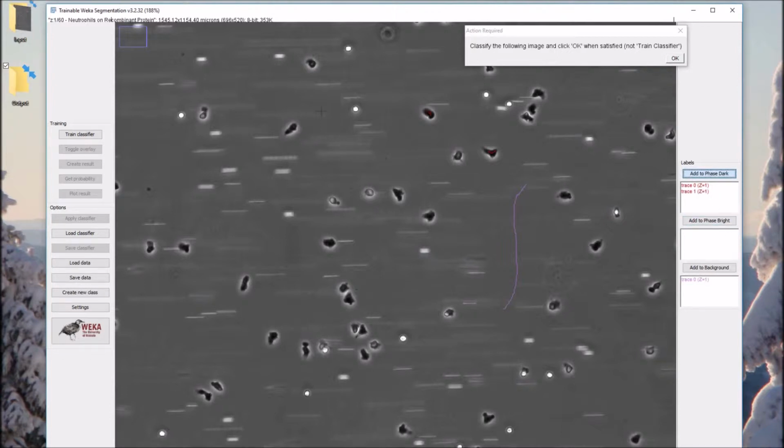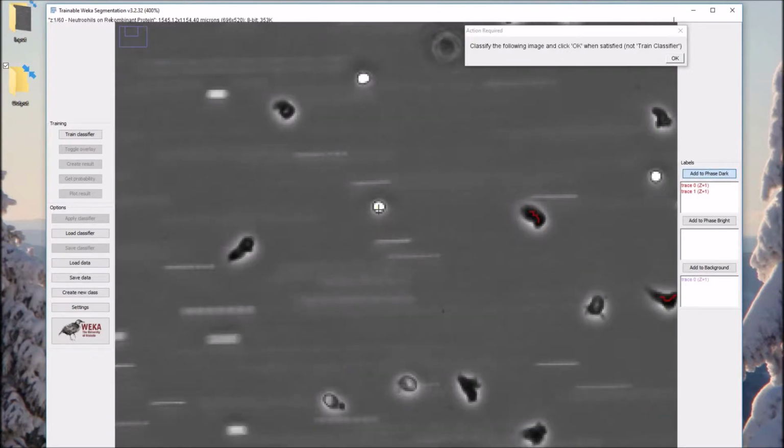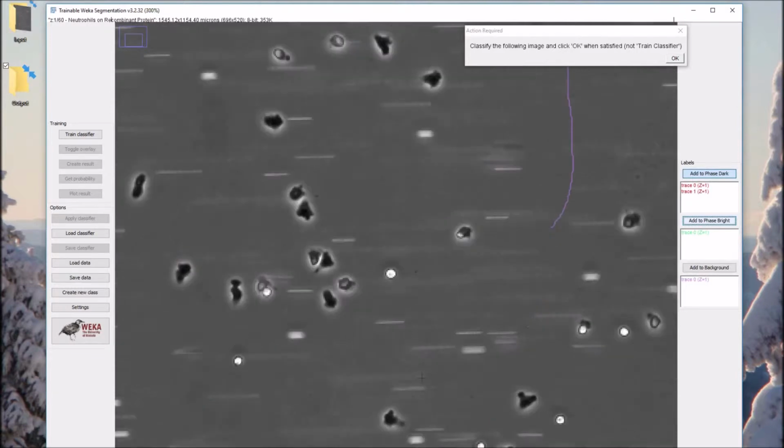To run the process, you need at least 2 traces for each category. I would recommend drawing 3 traces for each category, as I have found this to be an ideal number for an initial amount of traces.